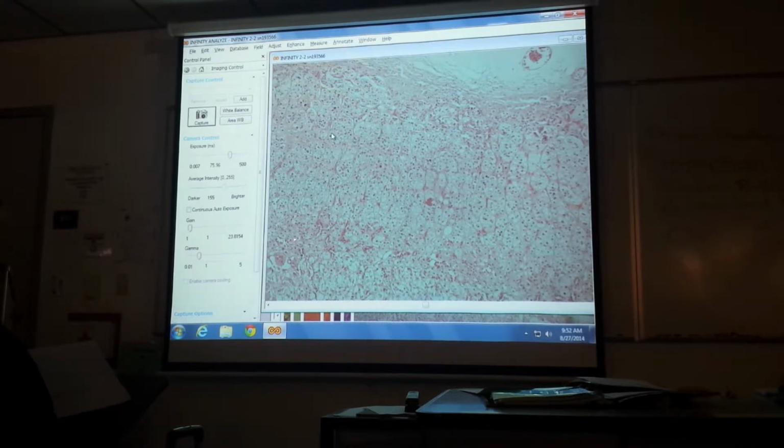I can tell, but it's the innermost zone. If you can't tell, it looks all the same to me. You just have to know. If I'm pointing by geography, I'm pointing out there, I'm pointing in the middle, or I'm pointing right there. If it's glomerulosa, fasciculata, reticularis, then the adrenal medulla down here.